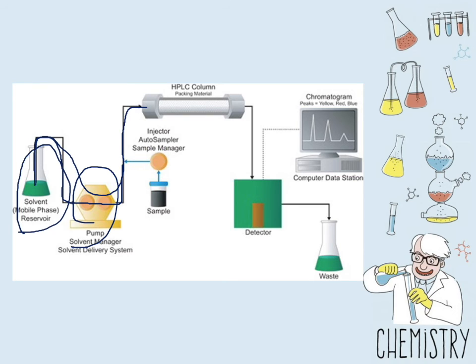The HPLC column contains the chromatographic packing material needed to effect the separation. So this here will be the place where the separation is happening.